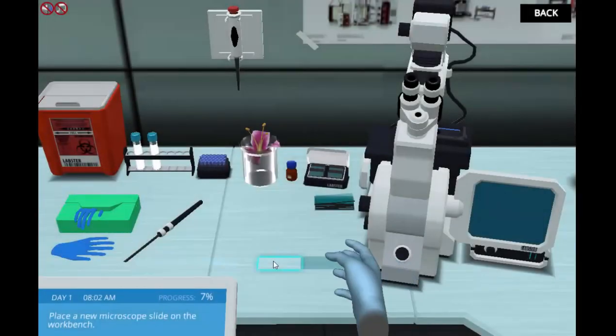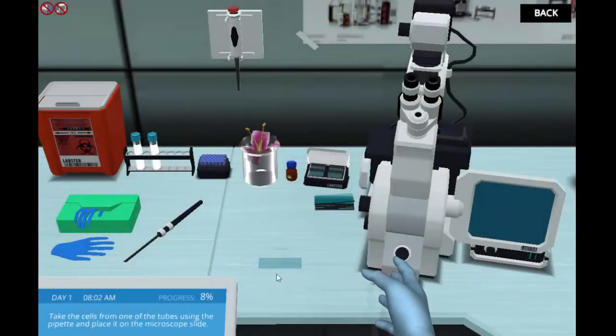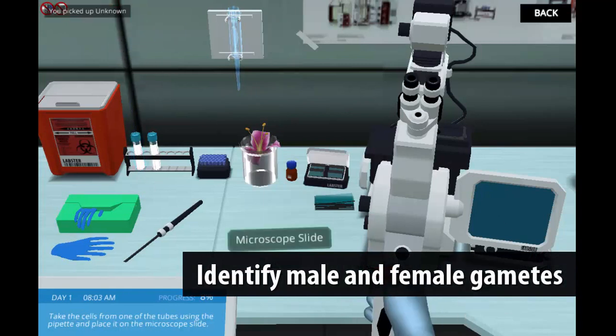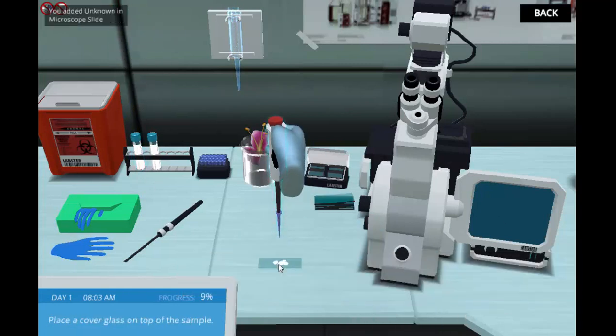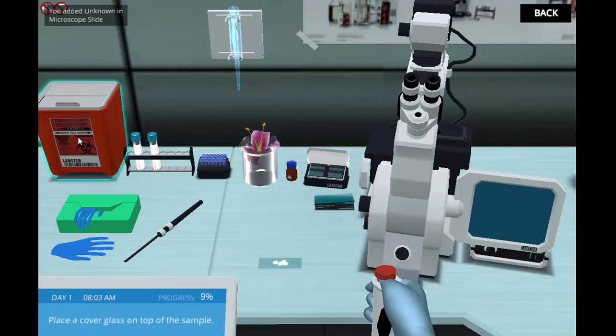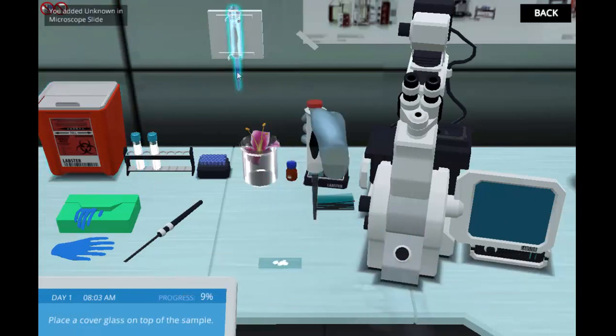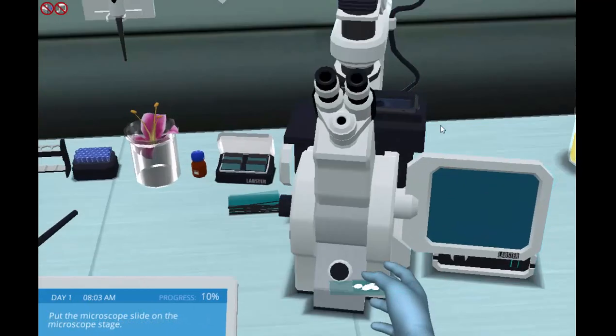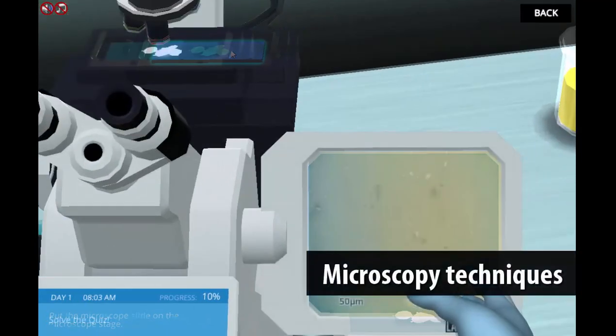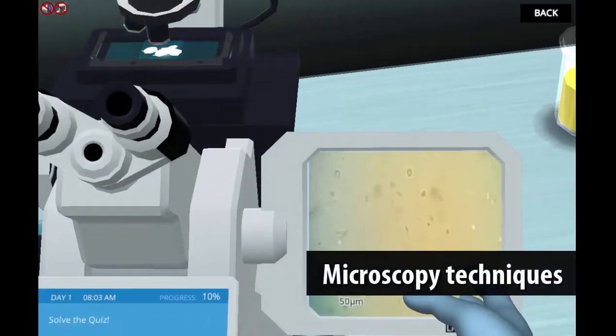In the virtual lab, students need to identify the main characteristics of male and female gametes — the sperm and ovum. They will use the light microscope for gamete identification.